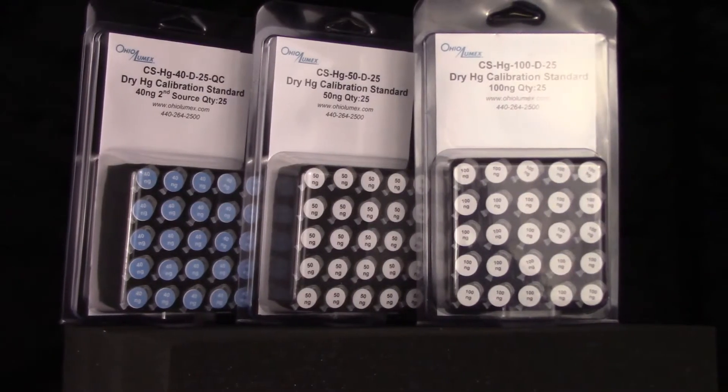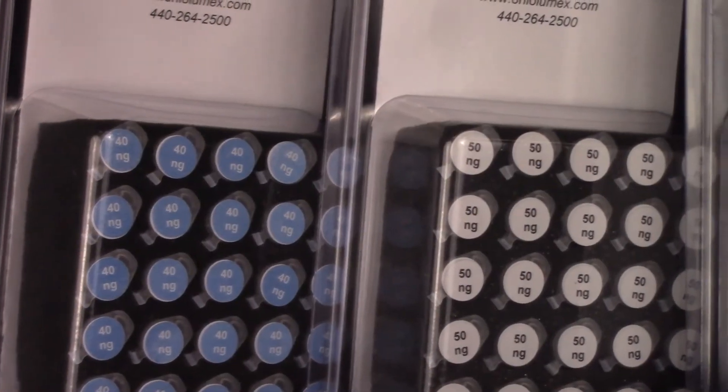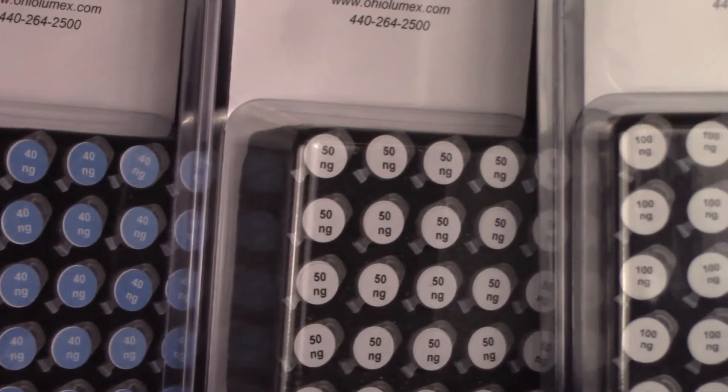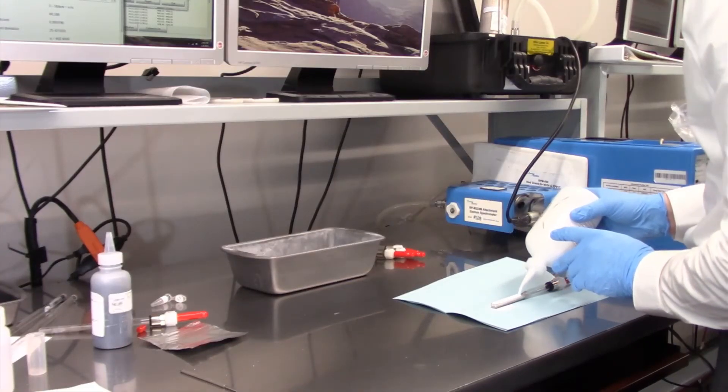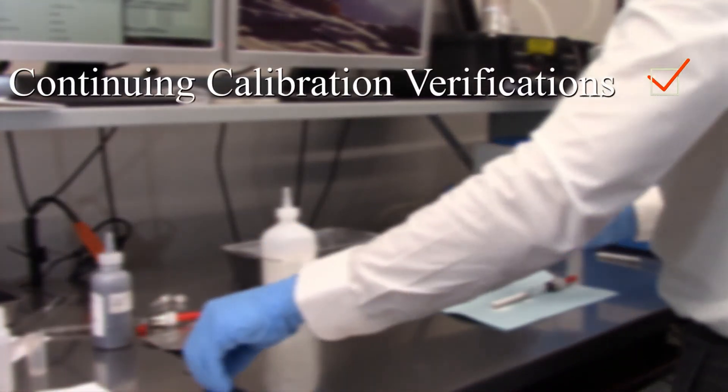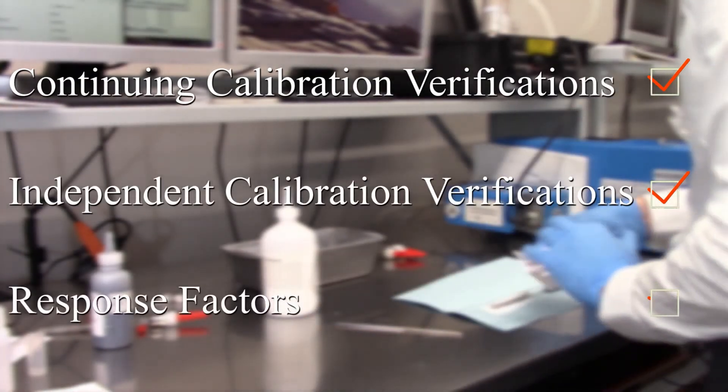The standards are made at several common mass levels needed for a typical calibration, but they can also be customized to fit your specific needs. The dry calibration standards can also be used for continuing calibration verifications, independent calibration verifications, and response factors.